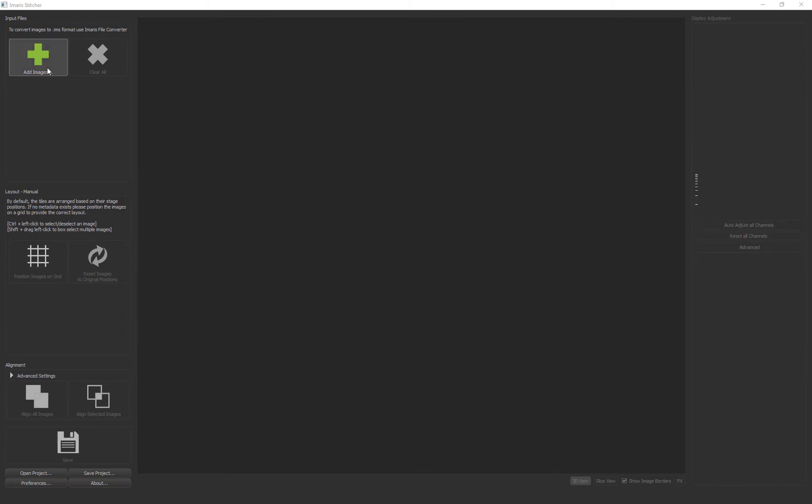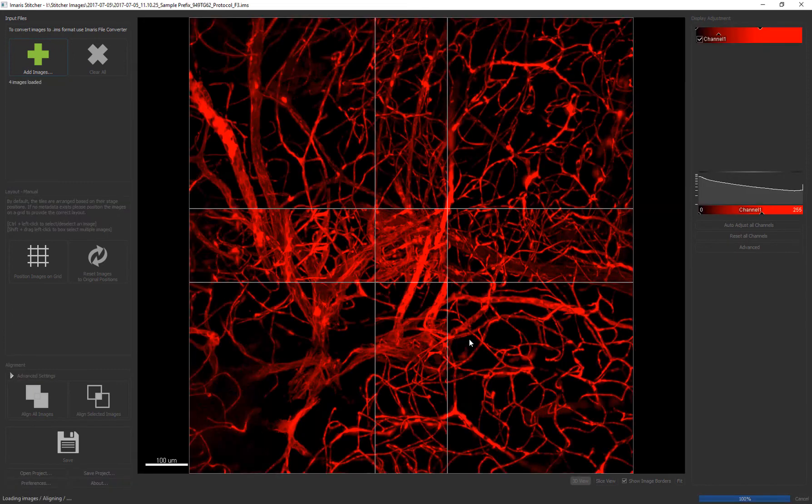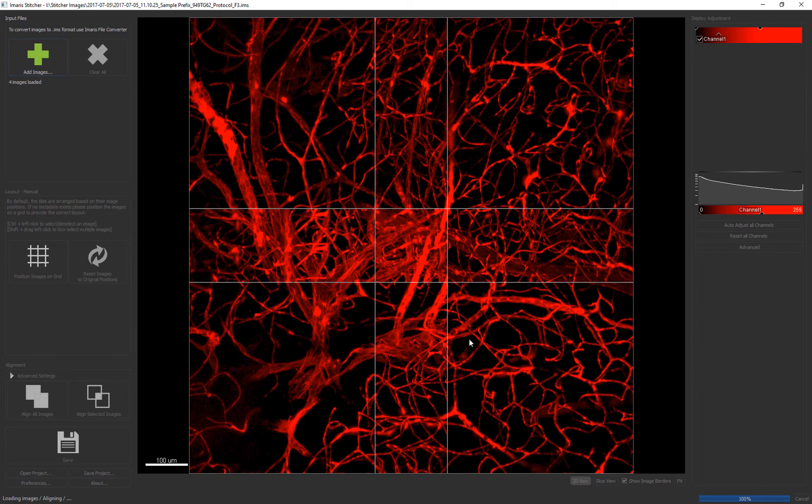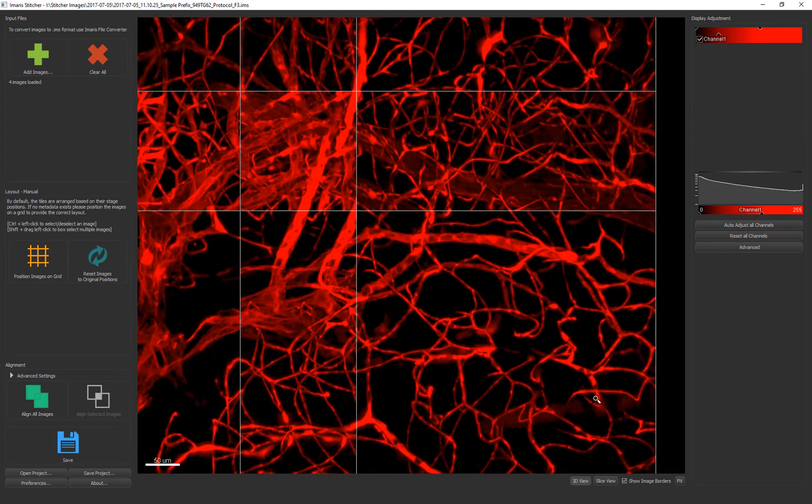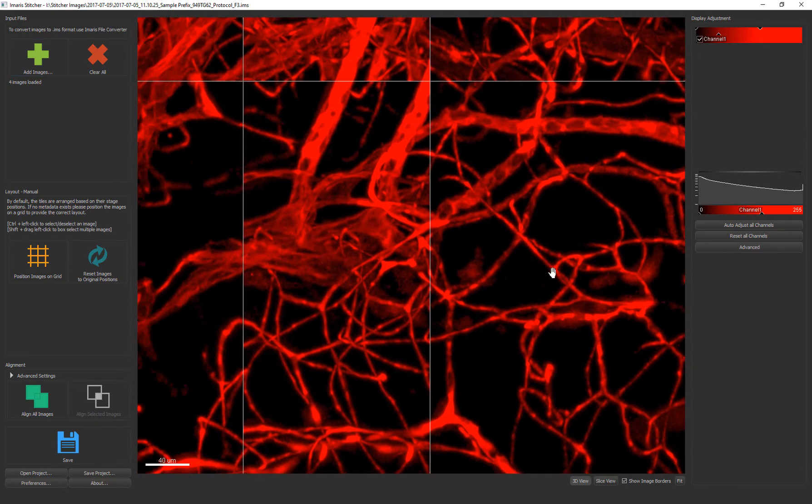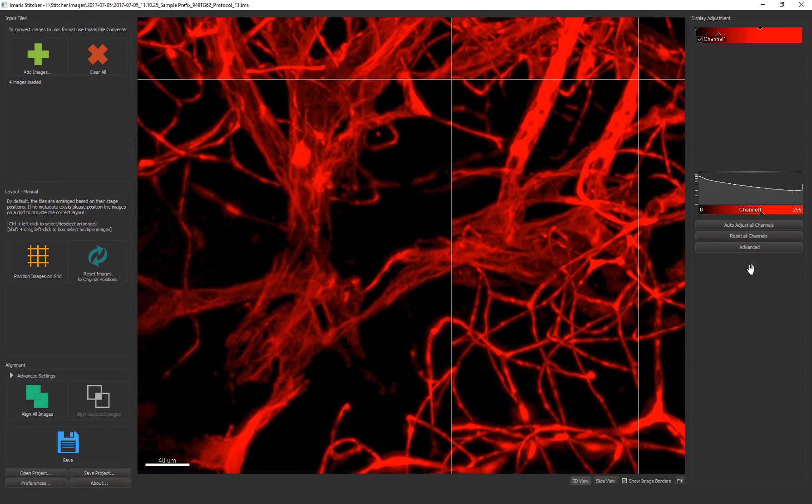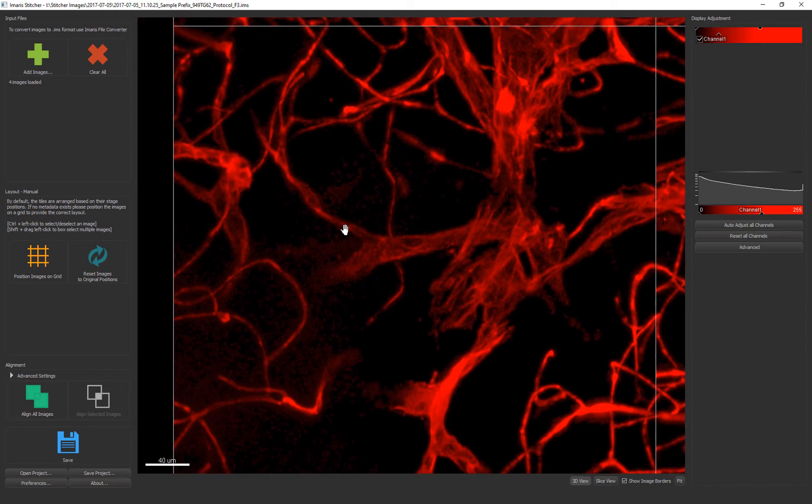Here I'm loading a demo set of image tiles. You can see that the stage coordinates are read and the tiles are arranged for a preview quickly and correctly. A 3D maximum intensity projection view is immediately available and I can zoom into tiles and pan around the field.